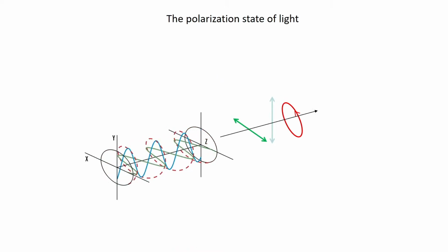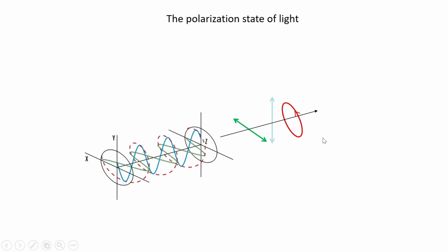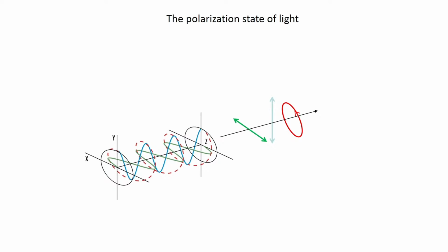It tells us how the electric field of light, which is oscillating, rotating in time, is going to be oriented, and this can be either linear, upon different directions, or elliptical, or even circular. This is something we can control in optics. And this polarization is going to act as either an excitation control or a probing control in our fluorescence properties.